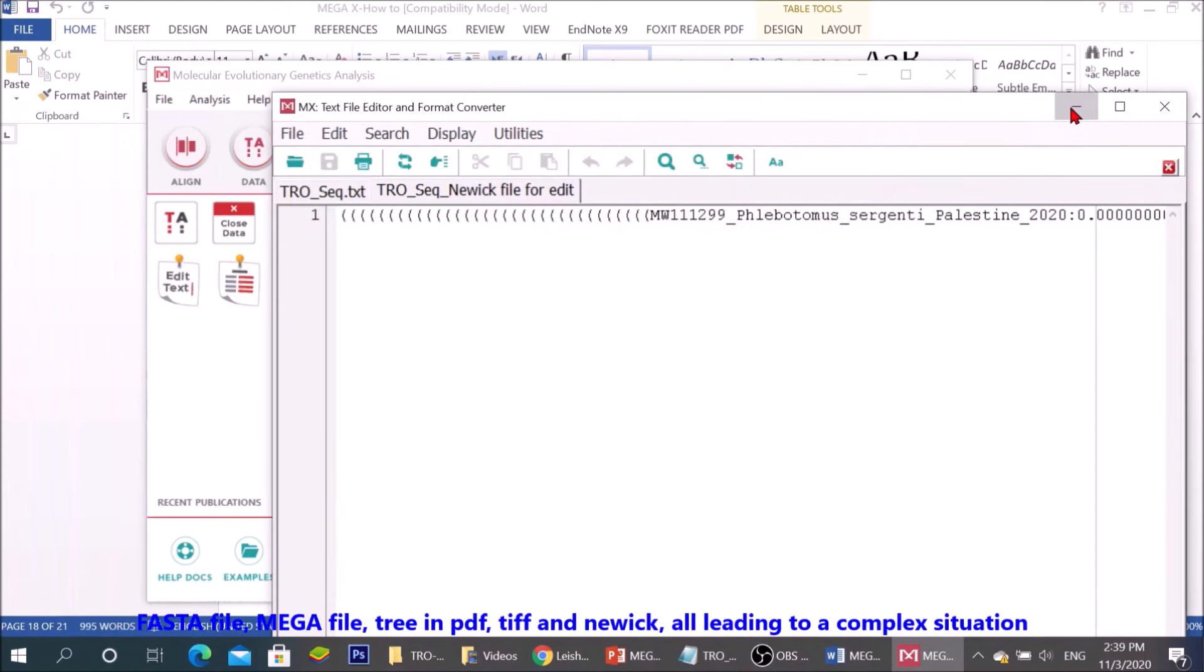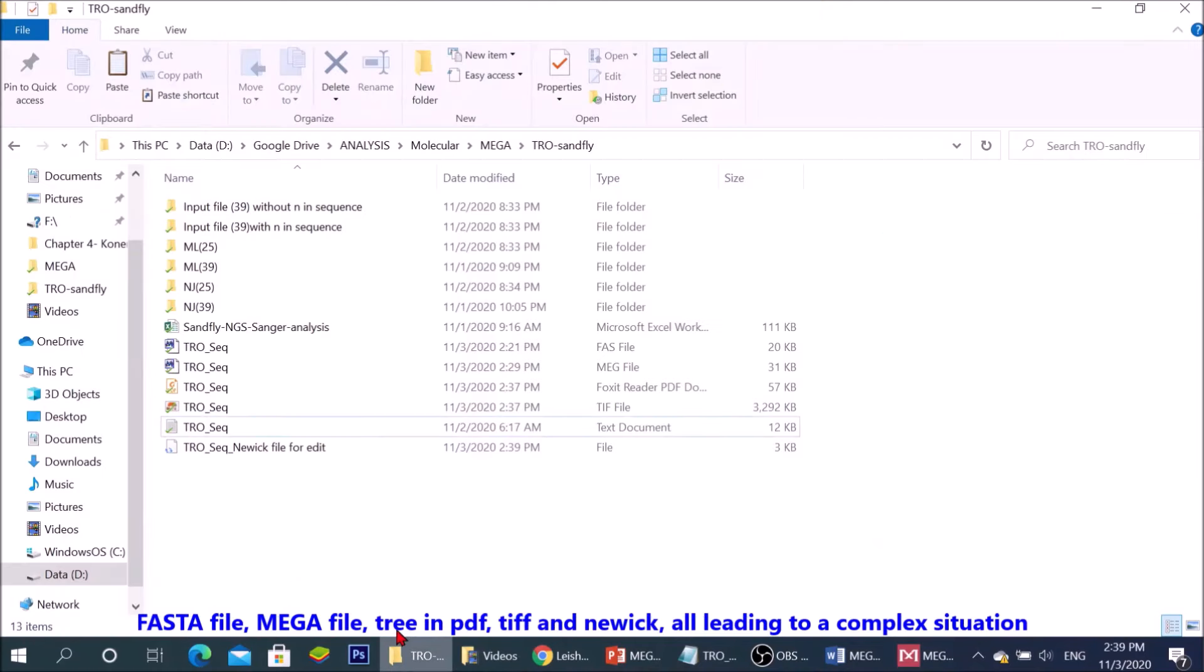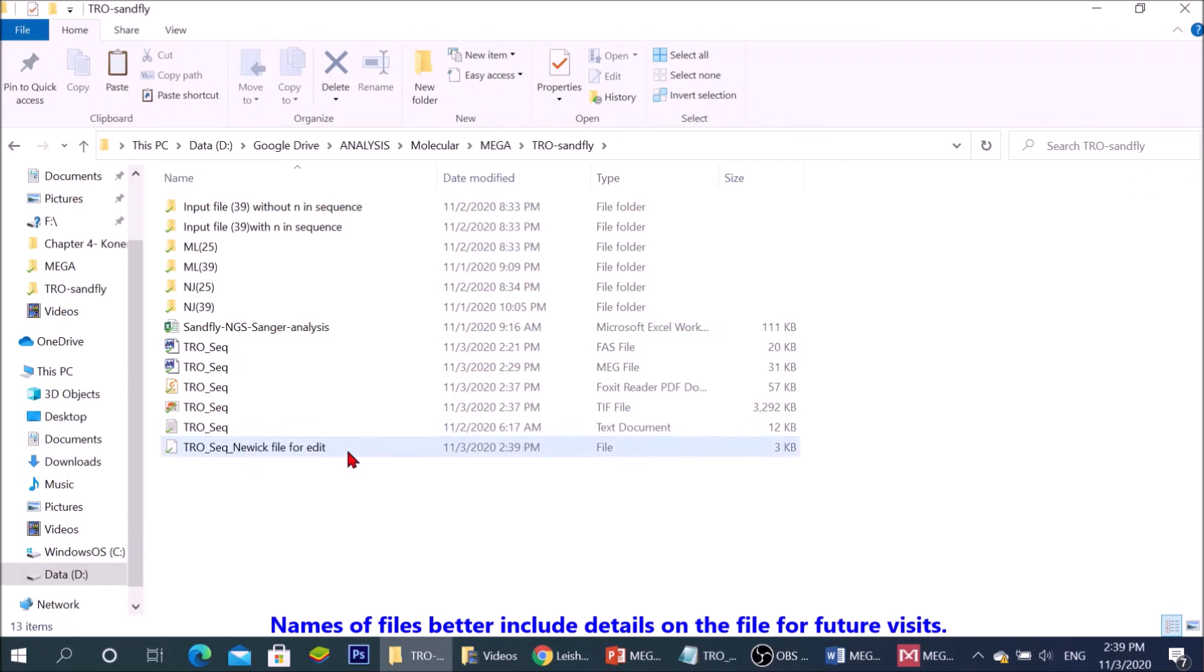FASTA file, MEGA file, PDF, TIFF and Newick, all leading to a complex situation. Names of files better include details on the file for future visits.